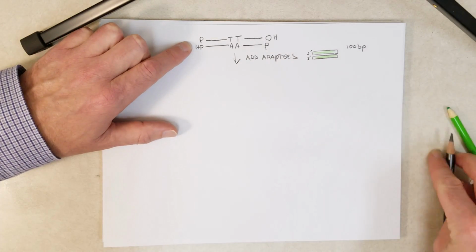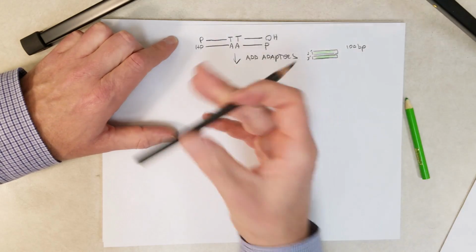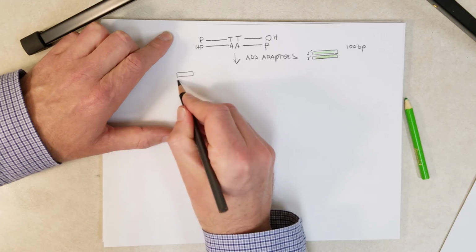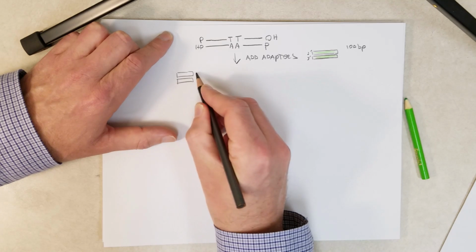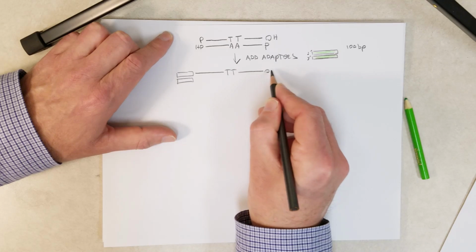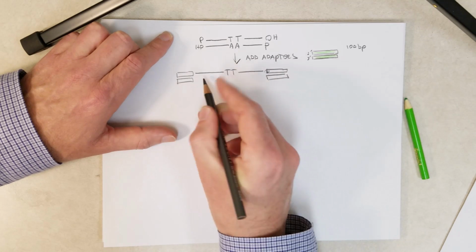So let me put these adapters here. So the adapters are going to be ligated to the ends on both sides.